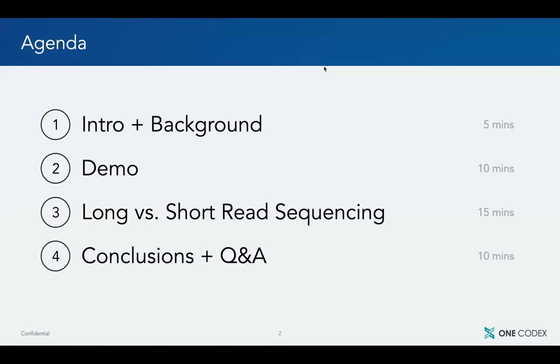And then we'll take a look at long read versus short read sequencing data and a bunch of analysis that I and the team here have prepared, comparing, again, Illumina short read V3, V4 sequencing data, LoopSeq sequencing data for 16S, and shotgun sequencing data. And then we'll conclude and take time to wrap up.